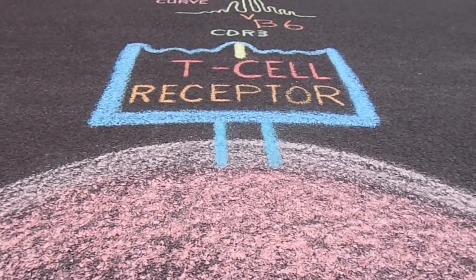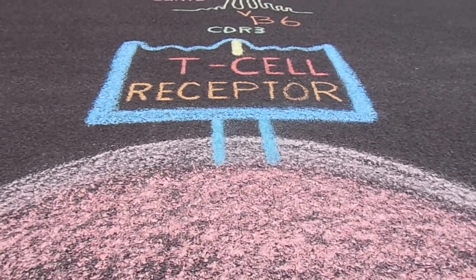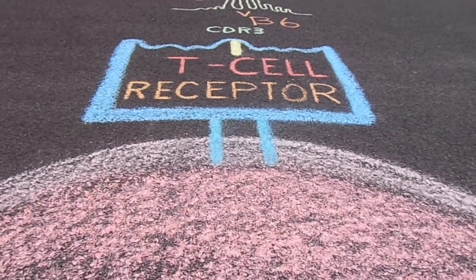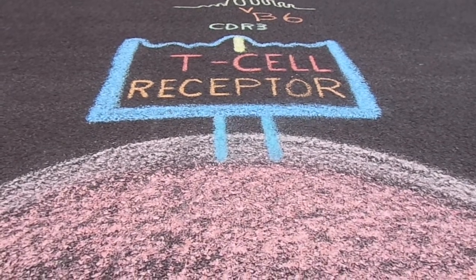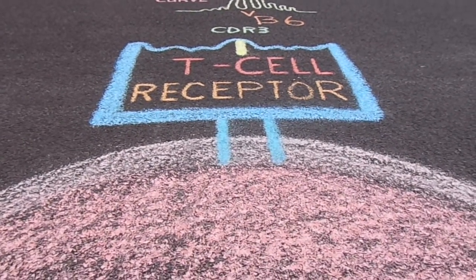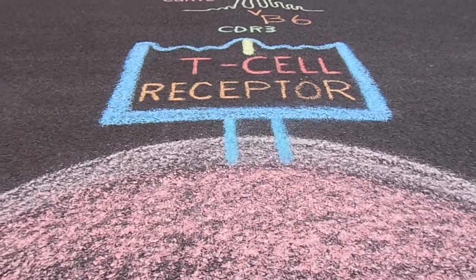A population of TCR V-beta genes will therefore show a distribution or spectrum of CDR3 lengths and will give rise to PCR products of different lengths that can be resolved, usually by polyacrylamide gel electrophoresis. The deletion and addition of nucleotides during the generation of T-cell receptors by rearrangement is random, and so in a normal individual, the CDR3 lengths follow a Gaussian distribution.